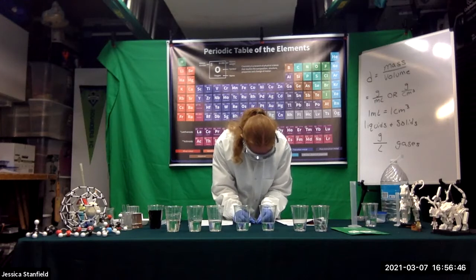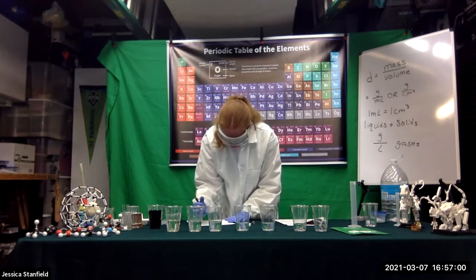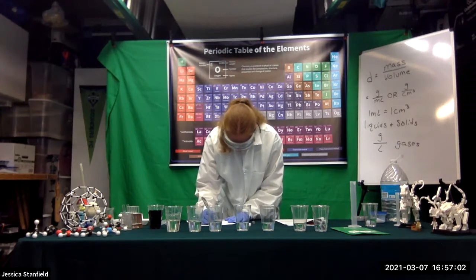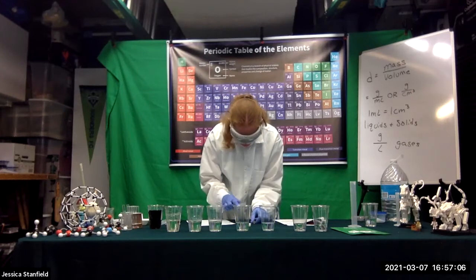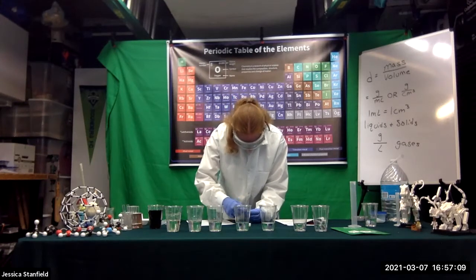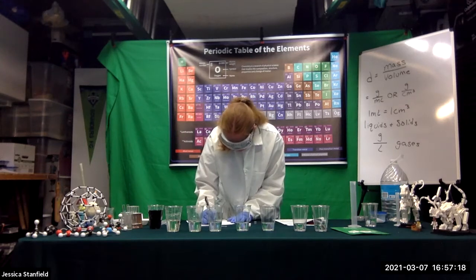Okay, so my cylinder looks like it is about 1.25 centimeters is what I'm going to estimate mine at. So that's my height. And then my diameter, mine looks like it's 1.20.